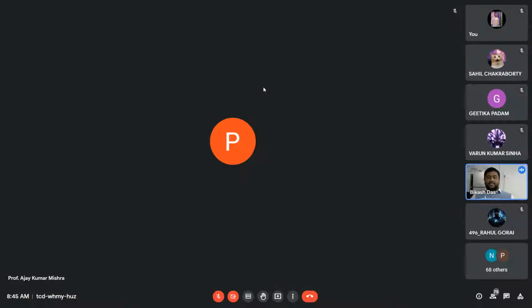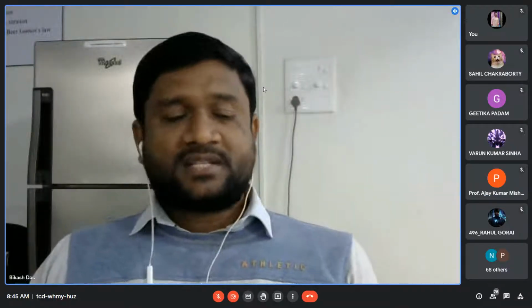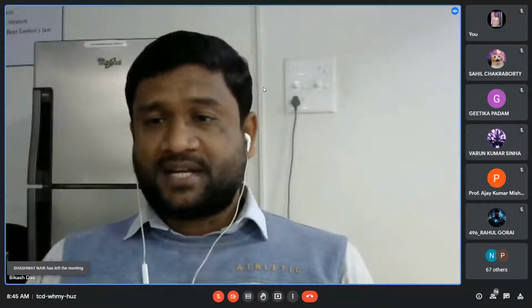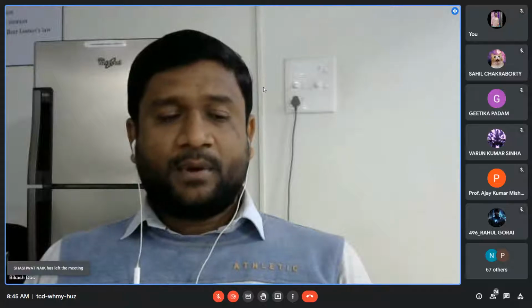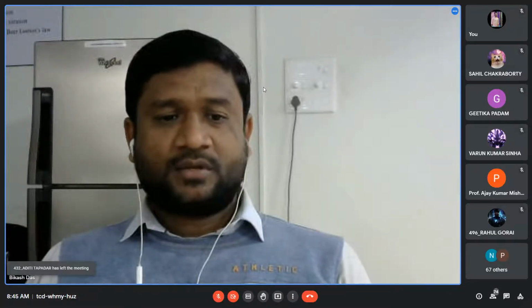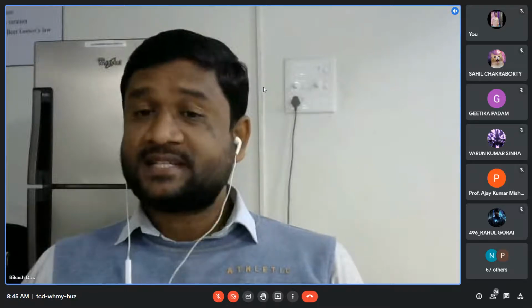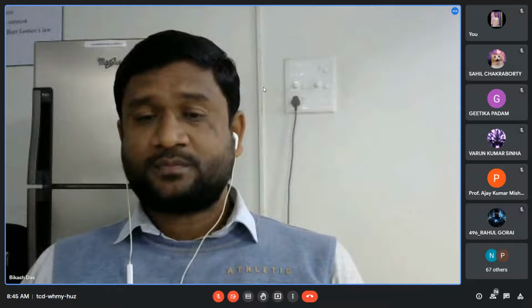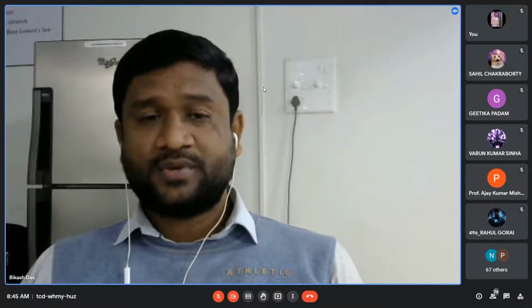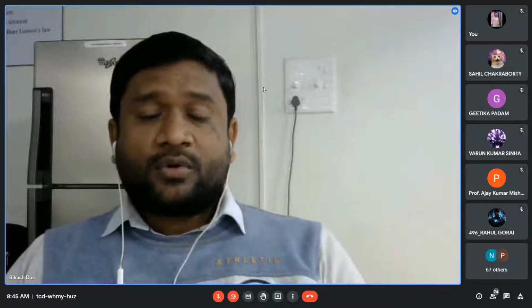Okay, the same types of experiments today also we are going to do. That is our conductometric titration. The brief idea about the conductometric titration, the theoretical part of today's experiment, has been very nicely explained by Professor Mishra sir. So I hope you people have understood very well. Now let us see practically how you can do the experiment.